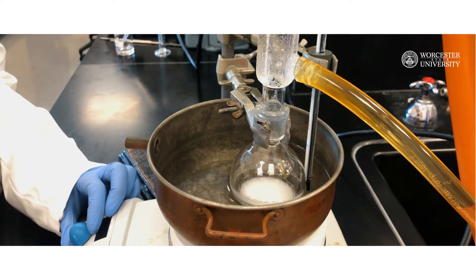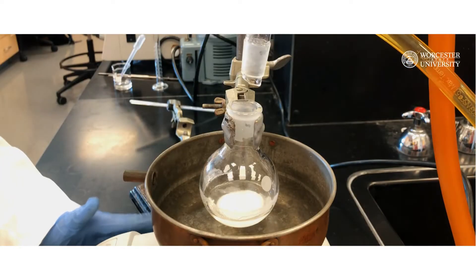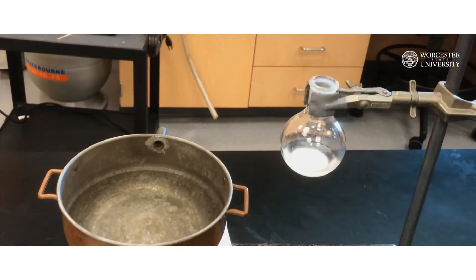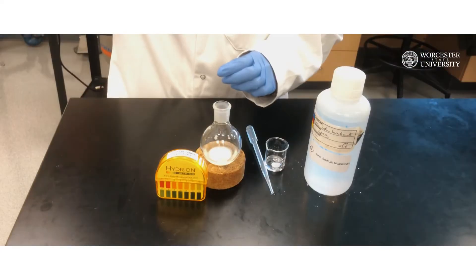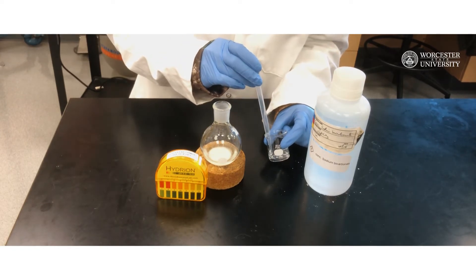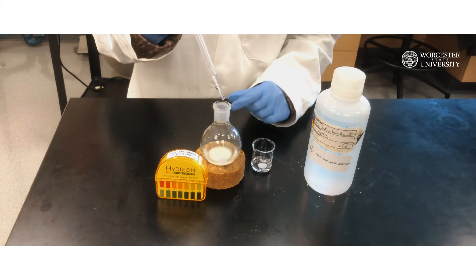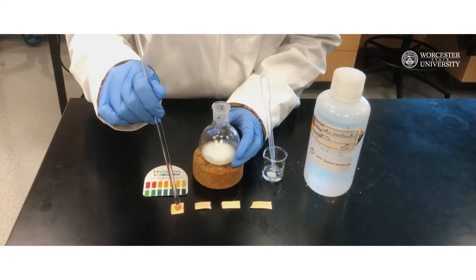After 20 minutes of reflux, remove the flask from the hot water bath and allow the reaction flask to cool down to room temperature. Part B: Isolation of brominated product. Once the flask reaches room temperature, you can begin the neutralization of excess HBr. To do so, adjust the pH of your mixture to around 5 to 7 by continuously adding saturated sodium bicarbonate solution and checking with pH paper.